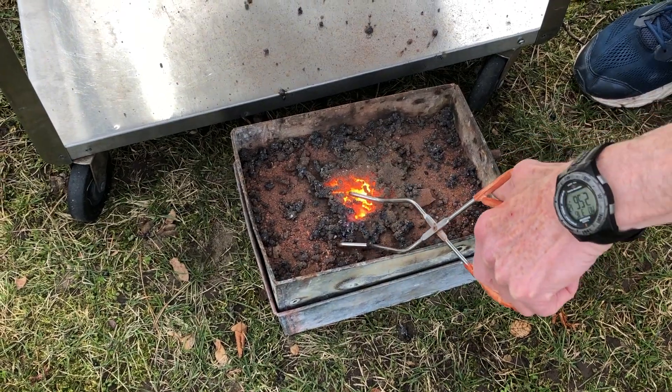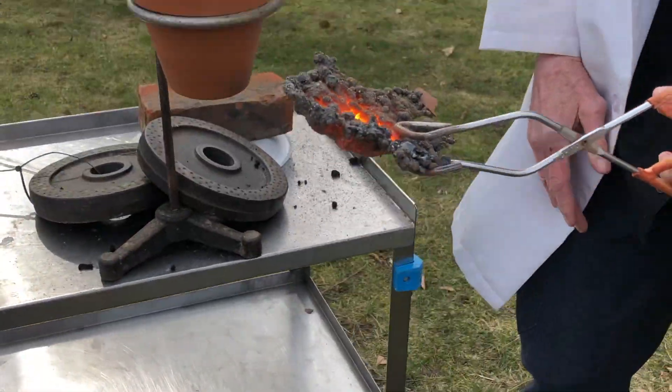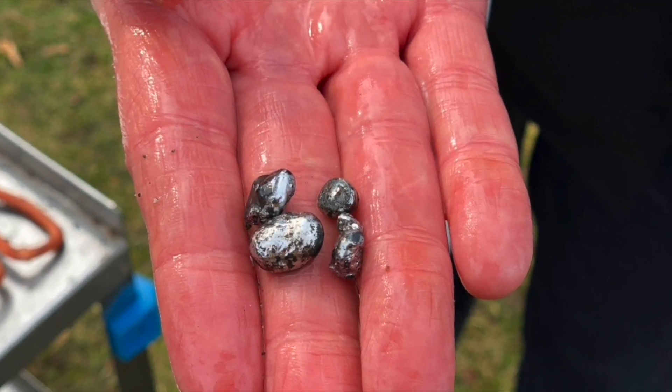That's all inside there. Once it cools down, we can turn around, crack it open, and you'll have usually little BBs of metal — really bright, shiny metal.